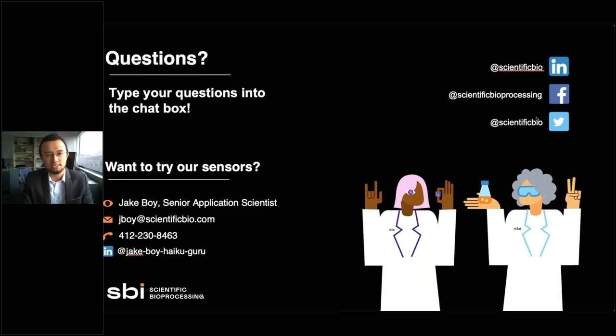Do you have anything to add, Jake? Daniel, that was awesome. I'm happy that you answered that. It was in much more detail than I could have given. All I really know is that we get a lot of people asking this exact same question. How do you measure the inside of a spheroid? And it's not possible with our technology.